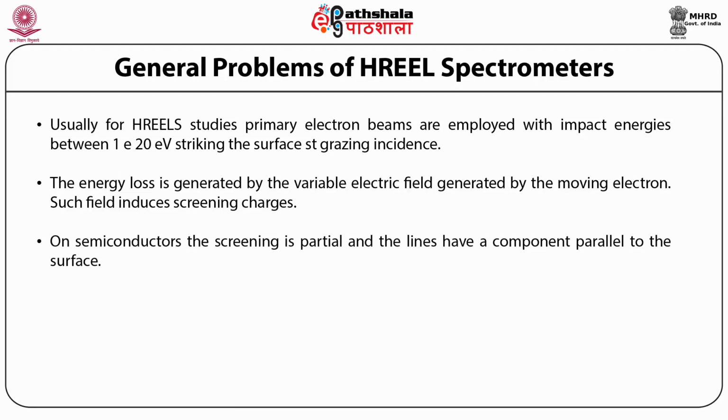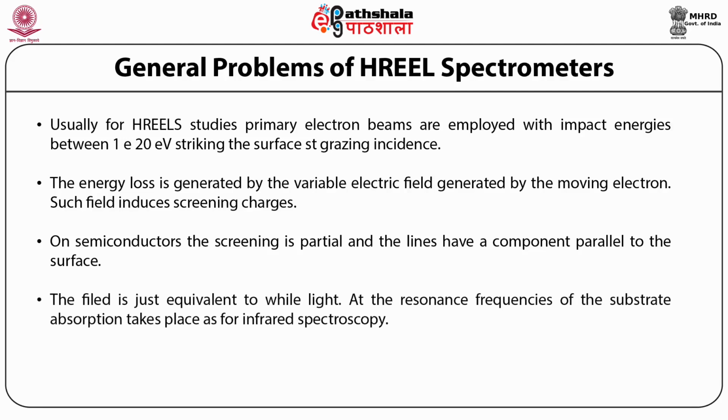The Fourier transform of the time dependence of the electrical field generates the frequency spectrum, which extends over the frequencies up to a certain cutoff given by the electron energy. The field is just equivalent to white light in these kinds of experiments.